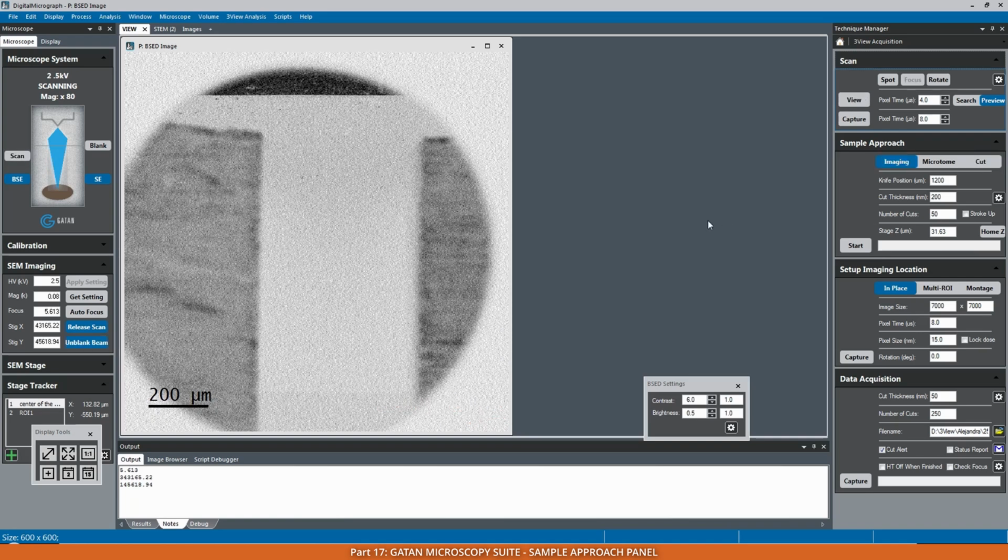Let's press imaging. We can see the knife position. If now I press the start button, it will start the approach mode with the parameters that we can define using this knife parameters dialog. It will use 0.4 millimeters per second as the cutting speed, 1.2 millimeters per second retraction speed, and now we can actually turn on the oscillator.